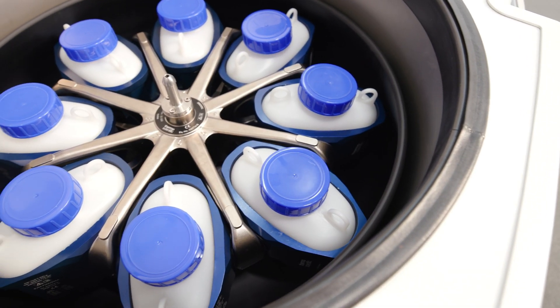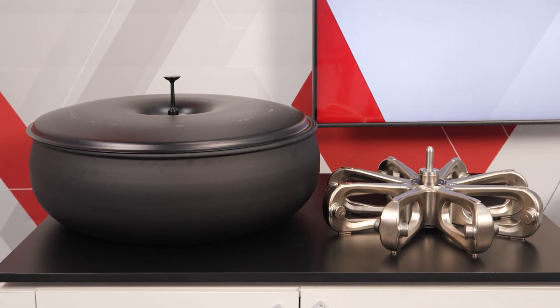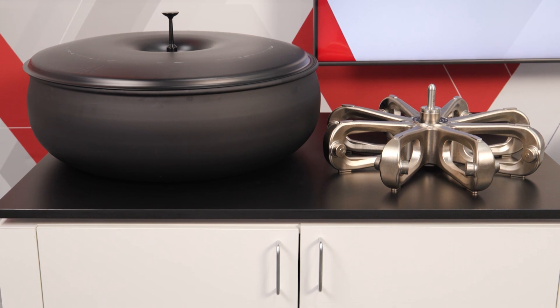Never overload the rotor and always balance samples. Use only Thermo Fisher Scientific approved rotors and components for your centrifuge.